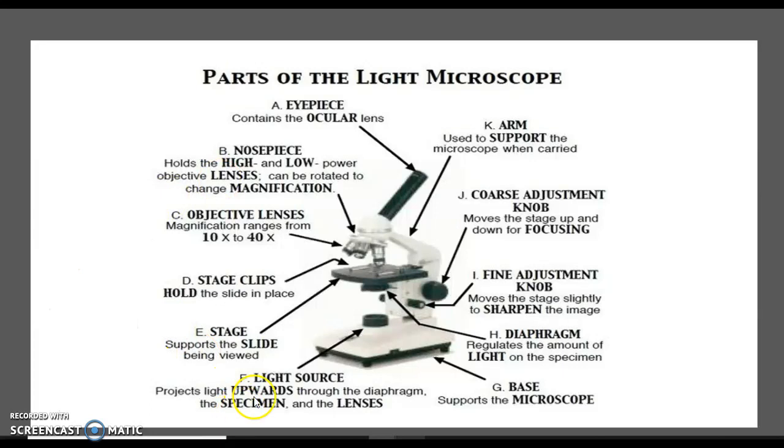We will then review the light source, which projects light upward through the diaphragm, through the specimen and the lenses.